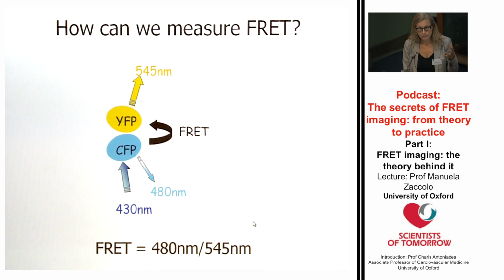How do we measure FRET? If we want to use this to measure biochemical events in the cell, we need a way to measure FRET changes. FRET can be measured in many different ways, some of which are quite sophisticated and require sophisticated pieces of equipment.